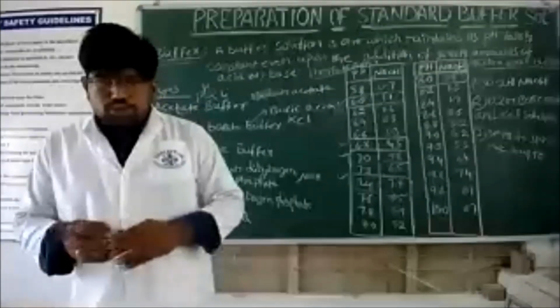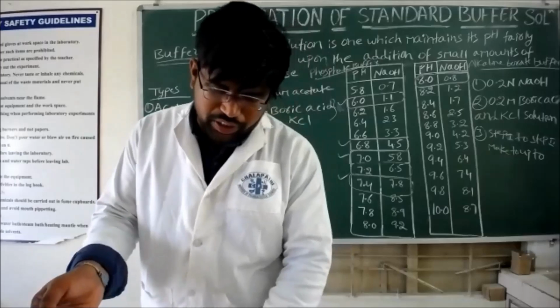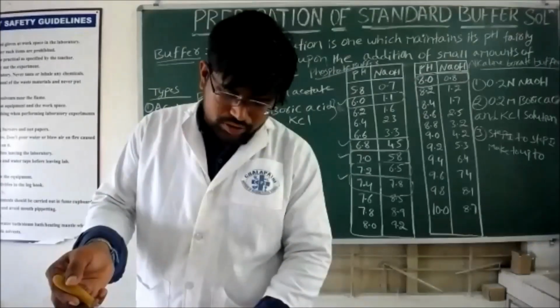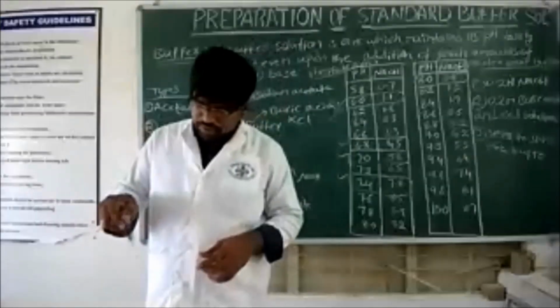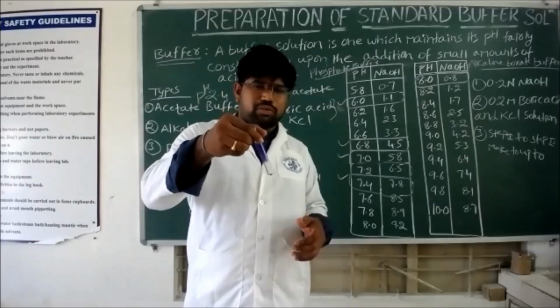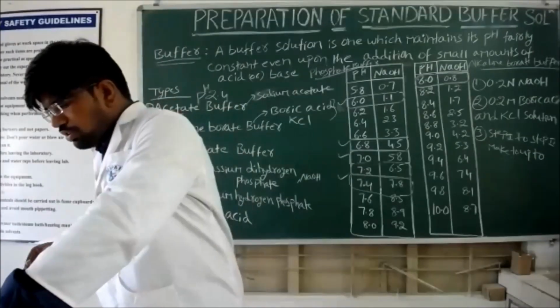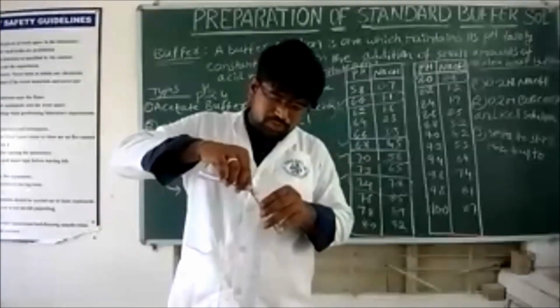Now to this mixture add universal indicator. Mix gently, and automatically it will produce a uniform color. Otherwise, you can transfer to another test tube or mix with a glass rod.